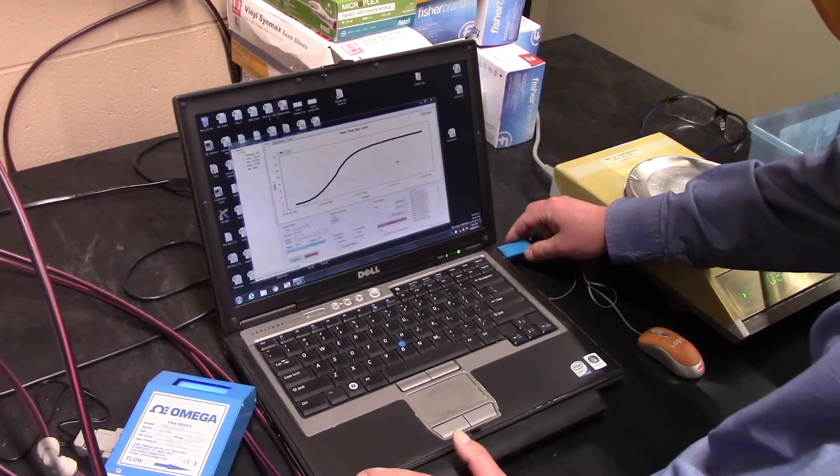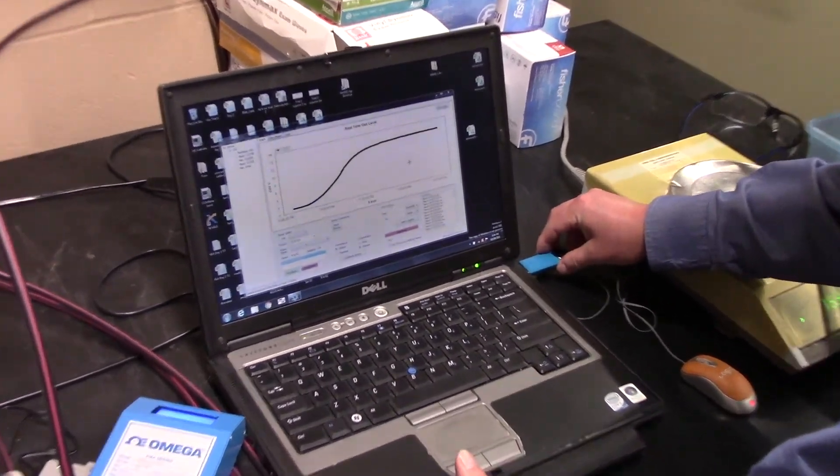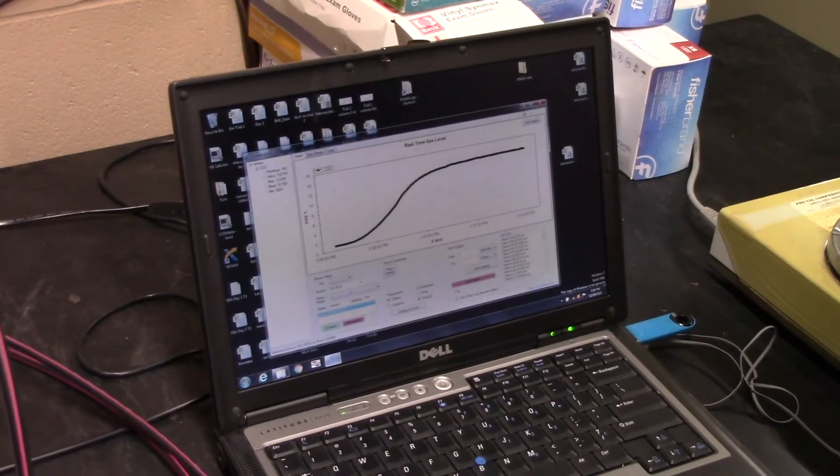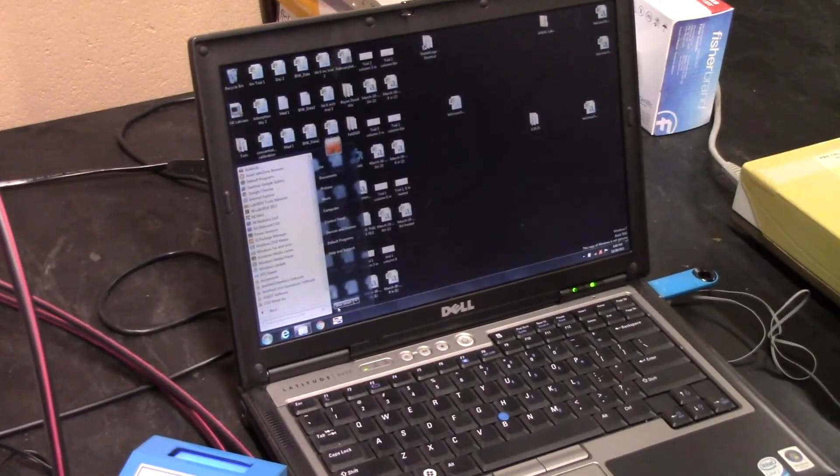Export the data by inserting a USB drive into the laptop. Click on the log files button and transfer over your file. Next, close GasLab and shut down the laptop.